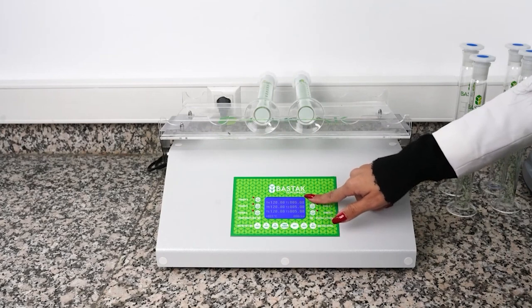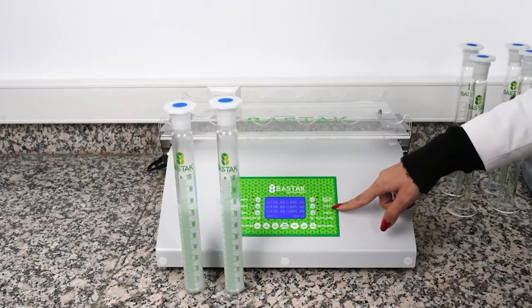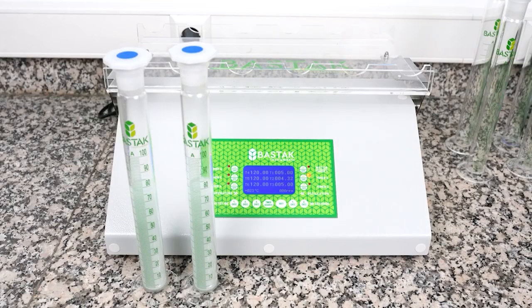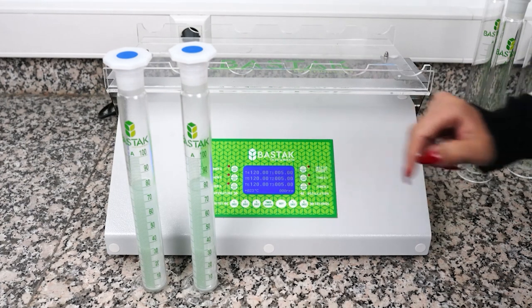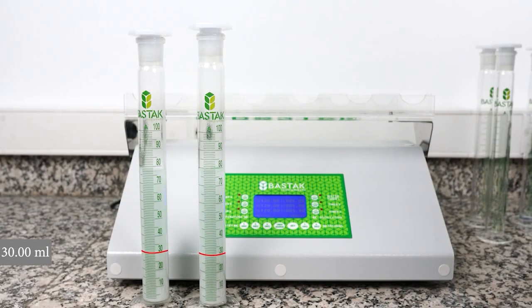Press the Motor Timer 1 button, and the tubes are carefully taken and placed on the table. Press the Timer 2 button to start the 5-minute waiting period. When the 5-minute waiting period is over, the device provides an audible warning. Press the Timer 2 button, and the sediment volume is read in milliliters from the numbers on the sediment tube. In our analysis, the Zeleny sedimentation value of the sample was read as 30 milliliters in both tubes.